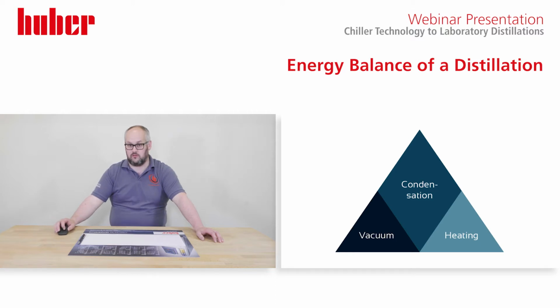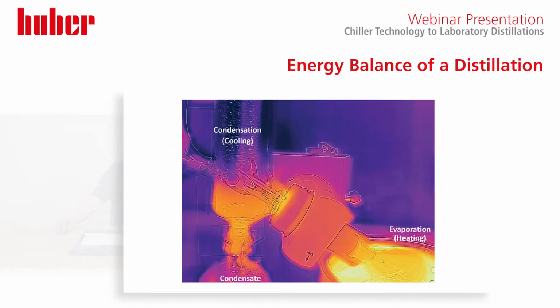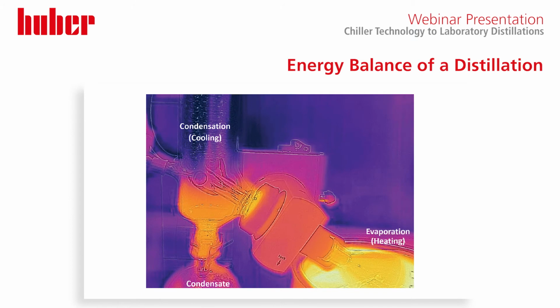If we think of your standard rotary evaporator, we have heating in the round bottom flask, and you can see in the vapor duct here, in this thermal imaging, we're going up and the vacuum is reducing the boiling point, and we're catching our condensate in the bottom, but you will see the cooling coil a darker shade because it's run colder.